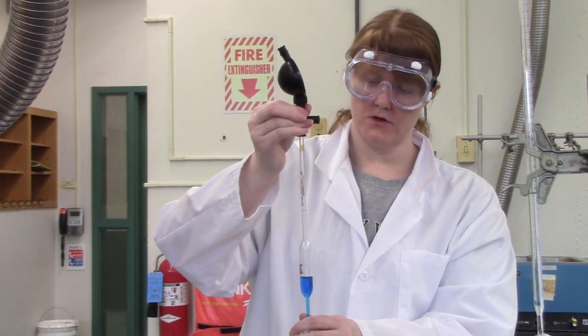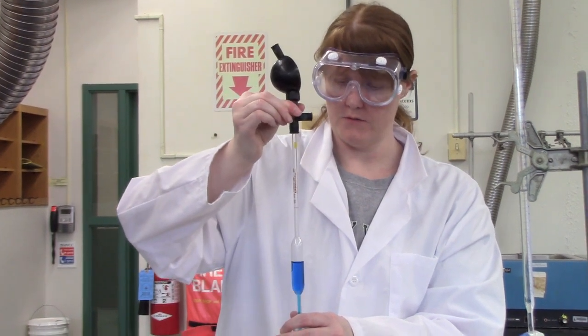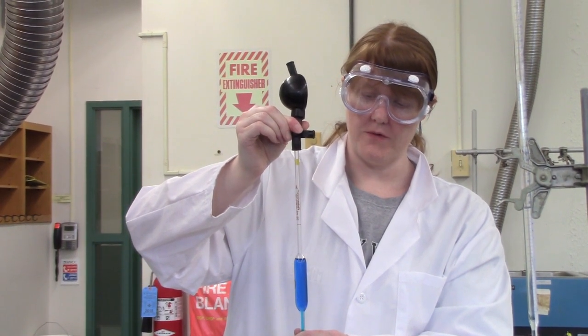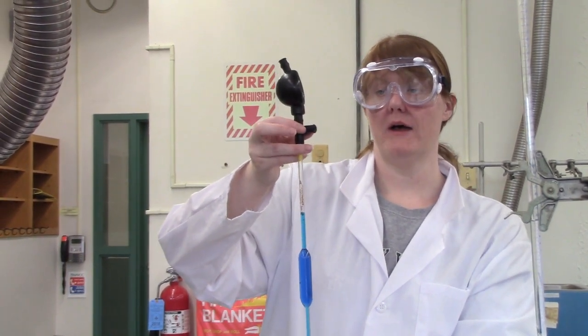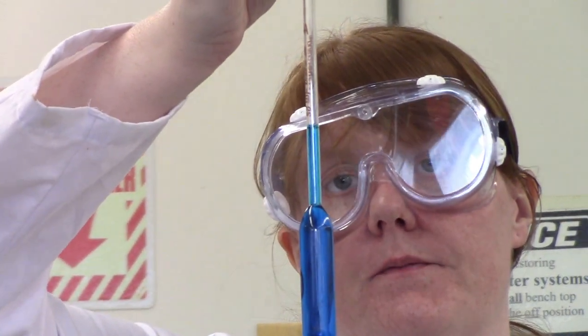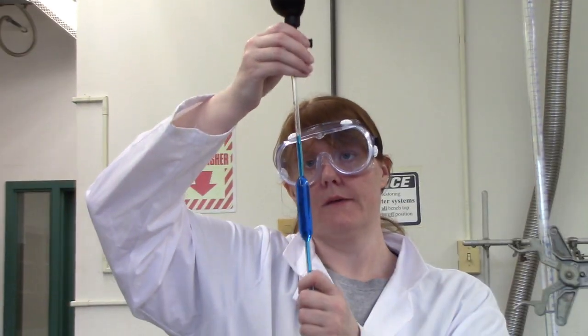This one's a little easier to control, but again, you have to have pretty strong hands. I don't, so it's a little tough for me, but it's not too bad. So you're going to go above the brown line again, and then drip out until the meniscus barely touches. To get it out, you expel, that's E. So it goes A to get the air out, S to suck, E to expel. So eye level again, and I'm going to get rid of the extra. And if I go a little too far, it's okay, I'll just go back in and try again.